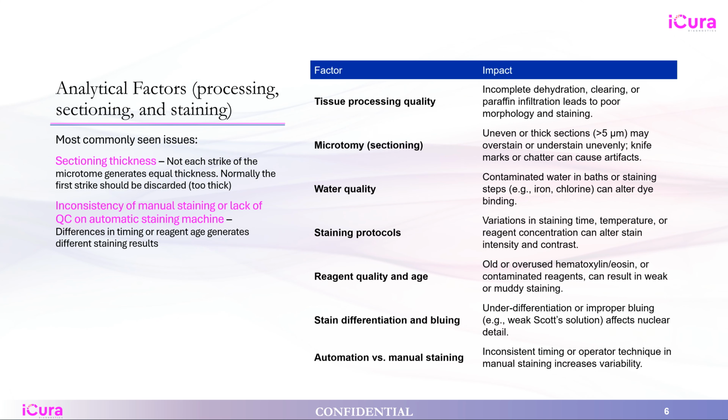In order to ensure that the downstream staining you'll be applying to these sections later generates reliable and accurate results, especially for semi-quantitative or quantitative studies, you want to make sure the section thickness is consistent or at the desired thickness you set on the microtome. And we'll give you some examples later of how important this is.